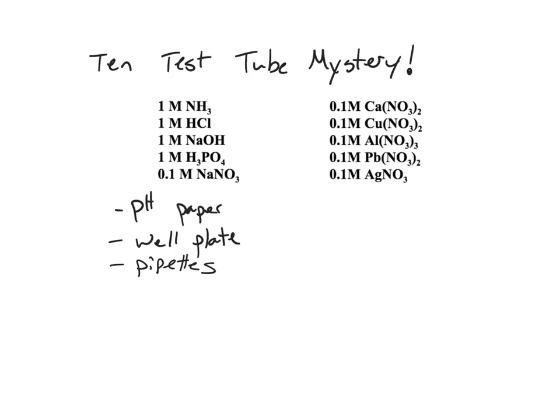And finally, the conclusion, you will write a detailed statement about how each substance was identified. And it may be a scientific chemical reaction that you observed, or it could be simply just an observation, like this liquid is pink to start, and it's the only pink liquid in the group, so we decided it was this. Or you could say, this particular substance smells very pungent, and this is the only one that when wafted smelled this pungent. So those are just qualitative experiments you can run, but some require an actual chemical reaction. So take a look at the conclusion. I put an example on the lab report. Each test tube should have a conclusion statement about it.